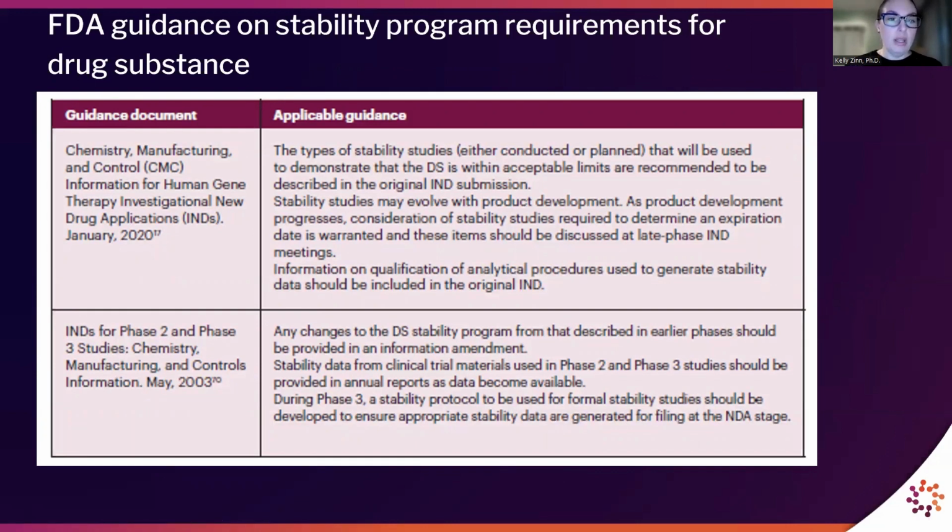So moving on, stability testing is conducted throughout the life cycle of lentiviral vector development on both the bulks and the finished drug substances. And stability testing serves to provide key information on how the vector is influenced by temperature and influenced by the storage container. So ultimately, the results of stability studies help to establish the appropriate shelf life of the vector and optimal storage conditions. And I touched briefly on the concept of comparability to assess changes in the viral vector drug substance. And similarly, substantial changes to the lentiviral vector manufacturing process should also be evaluated with appropriate stability studies.